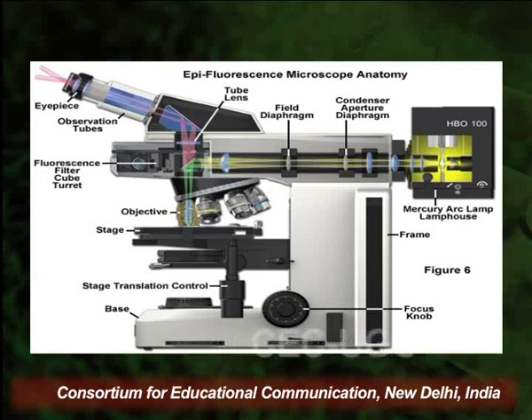So that's the basic structure of any epifluorescence microscope. We can understand the structure of epifluorescence microscope with the help of a longitudinal anatomy.